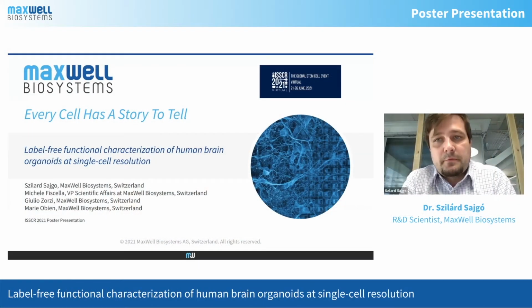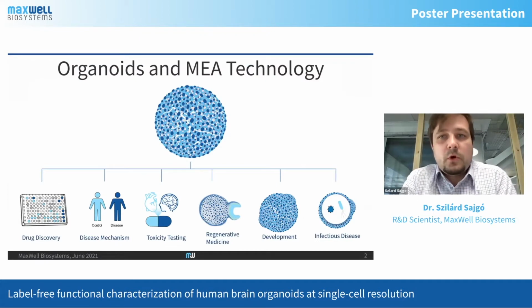My name is Szilárd Sajgó, and I will show you how your organoid research can greatly benefit from high-density electrode recordings. Why would one want to study human organoids, and what is their relevance?